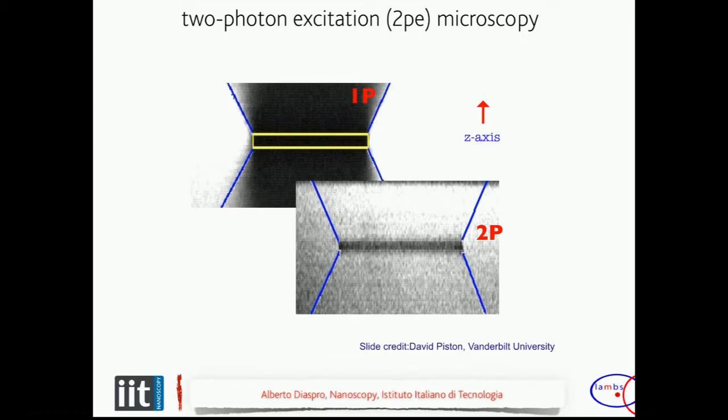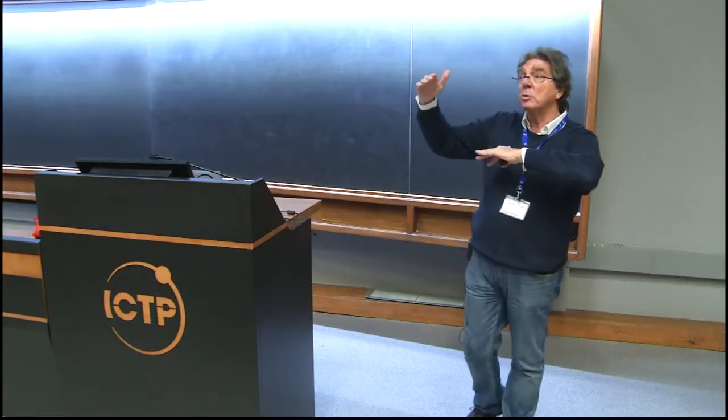We started from photobleaching. Now, if you consider the very same gel, and you switch off all the molecules by photobleaching in this region, and then have a look at what's going on in the adjacent region, you discover that nothing happened. And so now when you move your focus and find information on other optical planes, you are sure that, apart from diffusion processes, you are dealing with new molecules. You are not consuming the molecules before observing them.